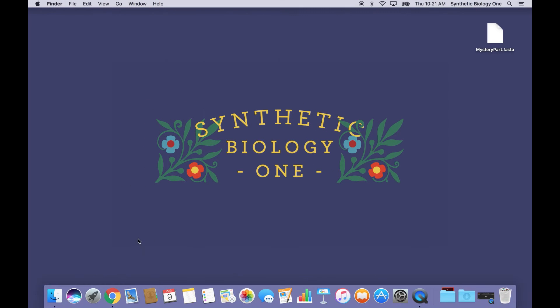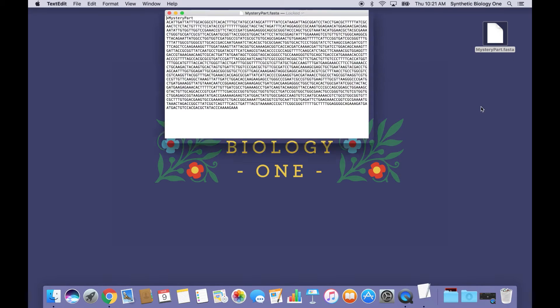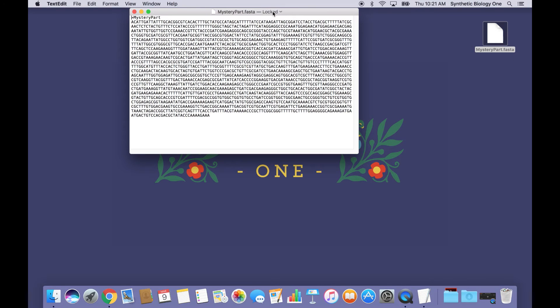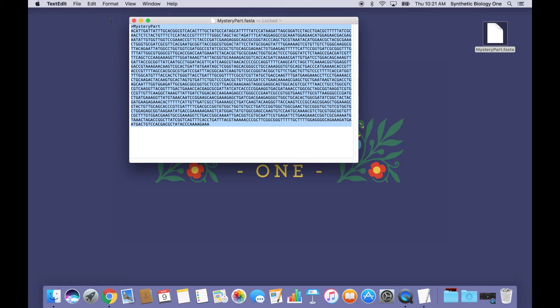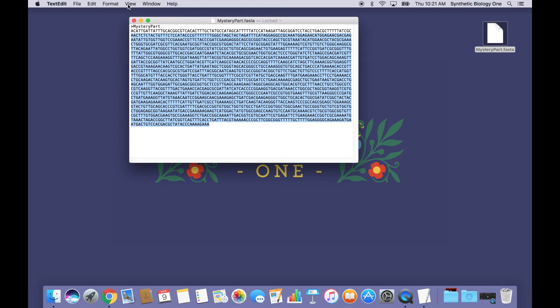So here we are inside my computer, and as you can see, I have a very mysterious-looking DNA sequence sitting on my desktop. It's called MysteryPart.FastA, and this is a DNA sequence in the very standard FastA format. It's a text file with the name of the sequence on the top, and then just a bunch of letters. Nothing that actually means anything, and it's our job to figure out what this is doing.